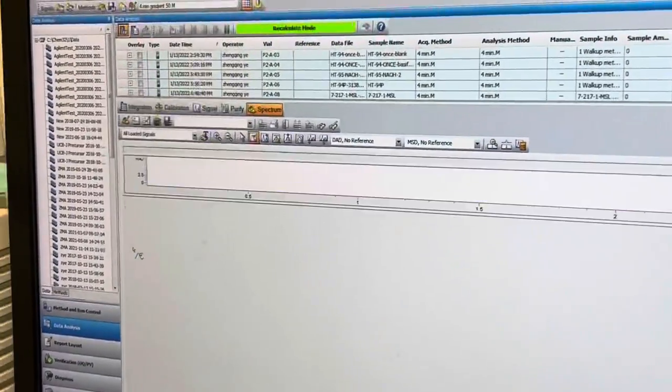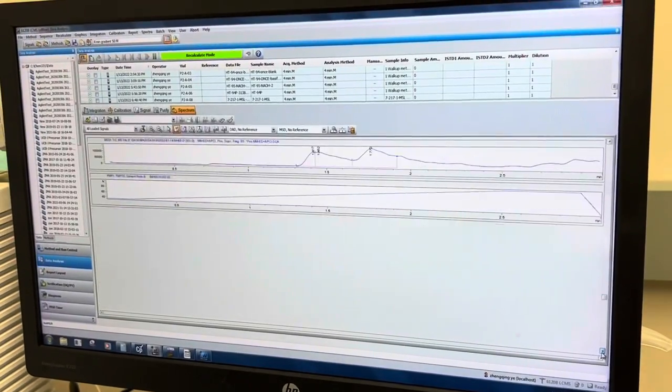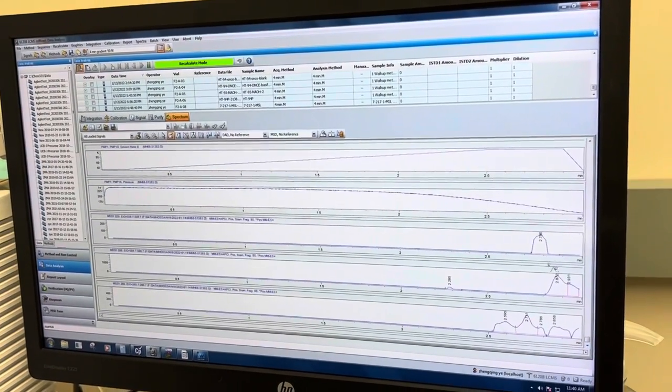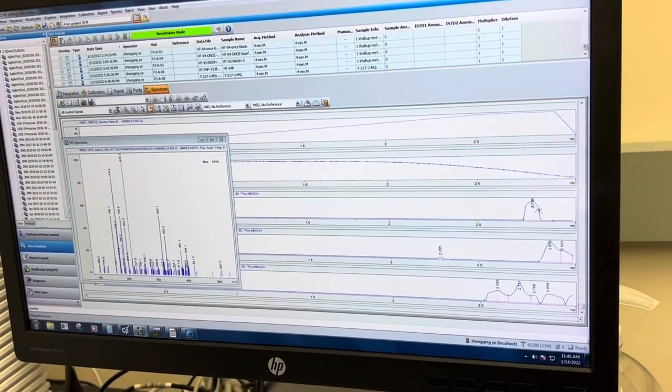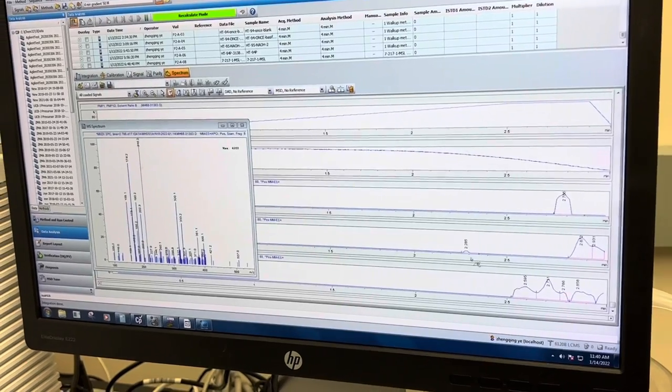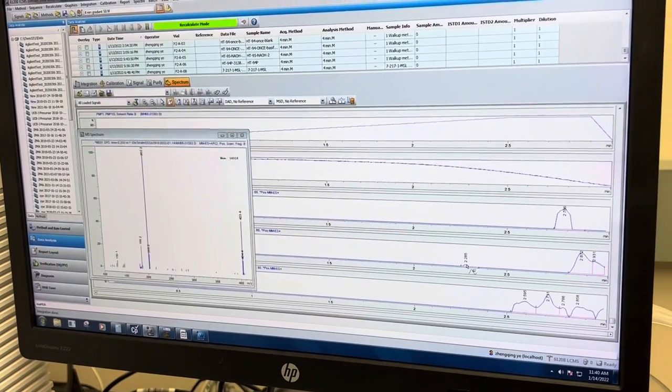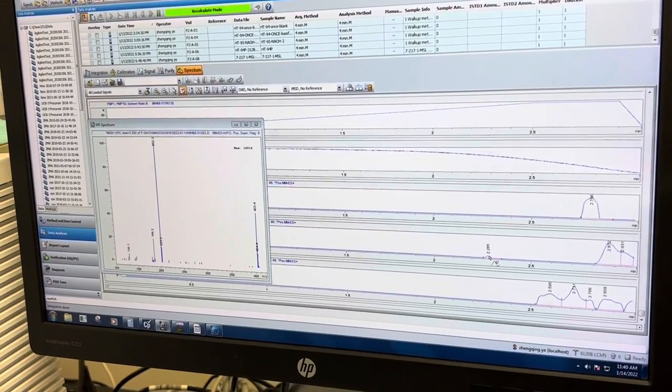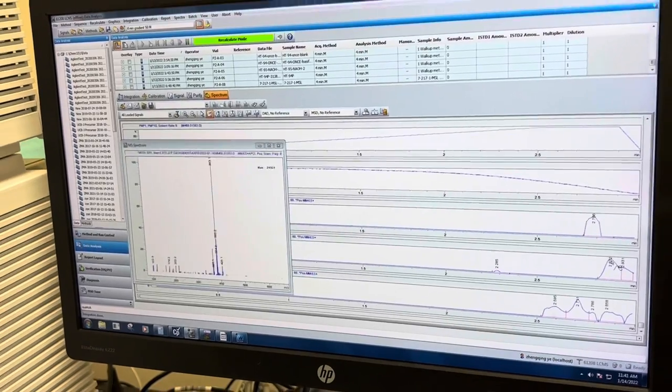So it will extract and go, you can go down from there and you'll see those peaks and click those and you can see those peaks and click those in terms of retention time. So you can see something there.